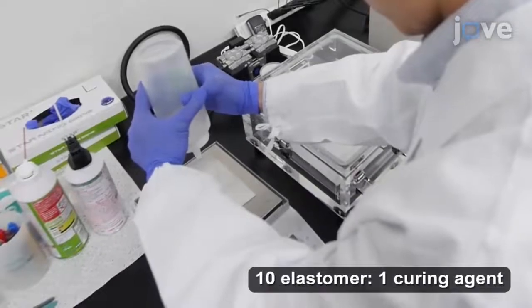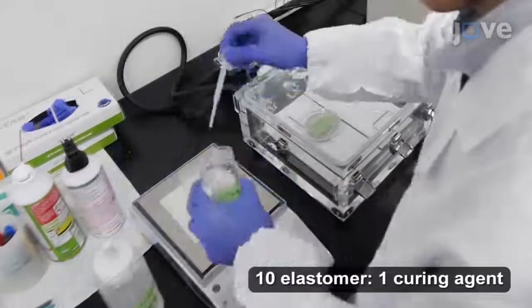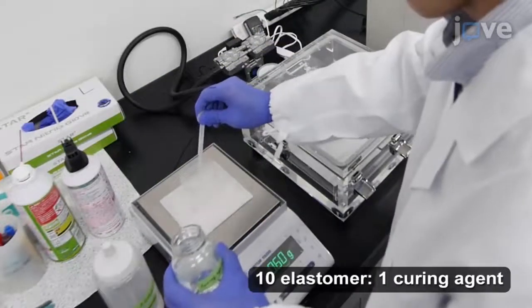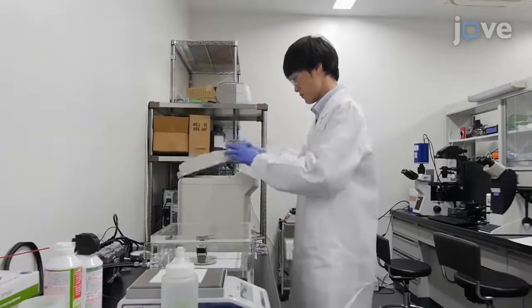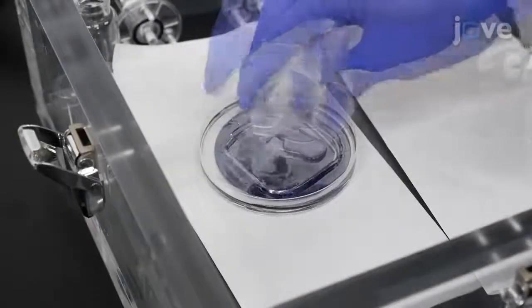To make a device for examination of the growing pollen tubes and moss protonemata, first make approximately 11 grams of PDMS and load it into a 4-inch mold.